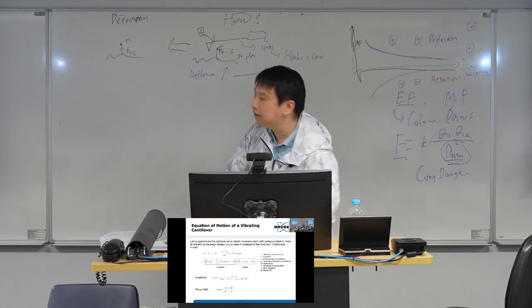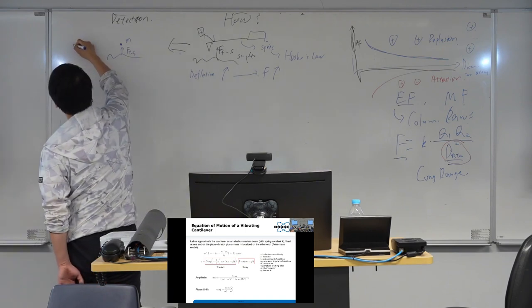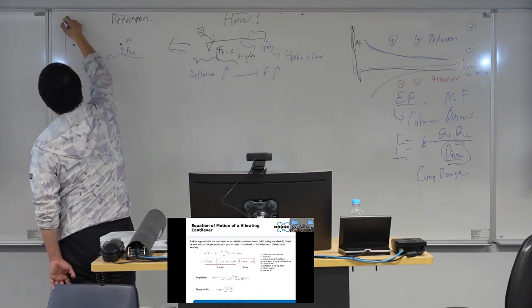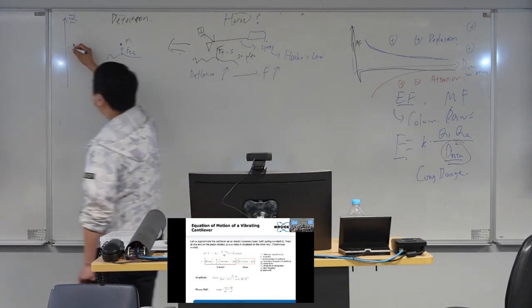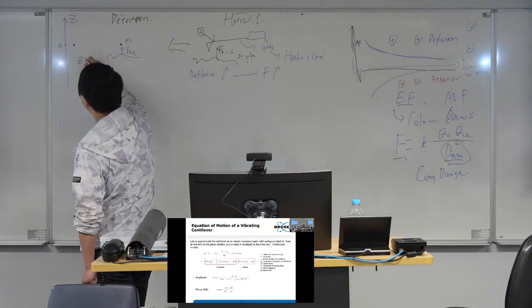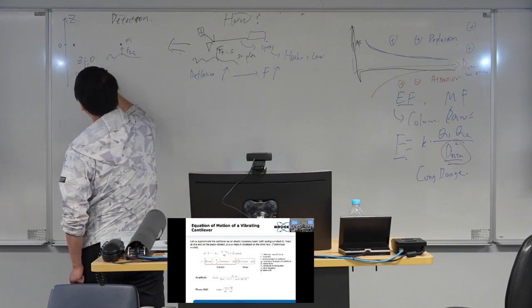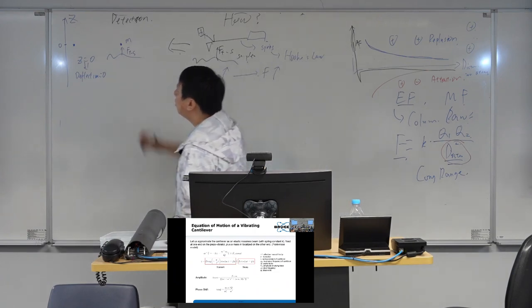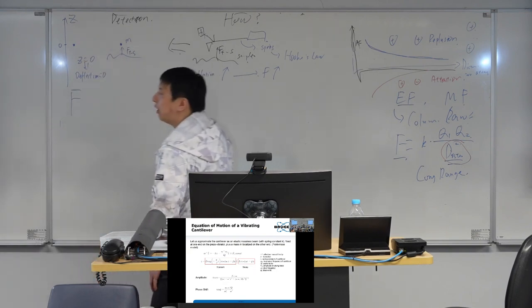So we place a coordinate here. If we place this mass, the point, on this scale, and this scale is in the z direction, we define the zero position, meaning the deflection is zero. So at this point, we can definitely know the probe will have the first force.